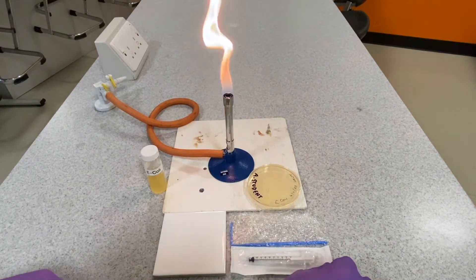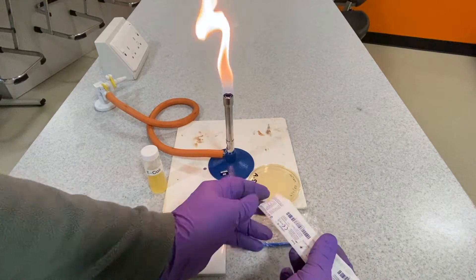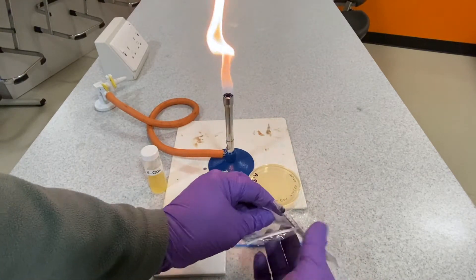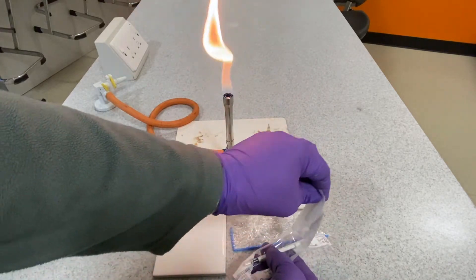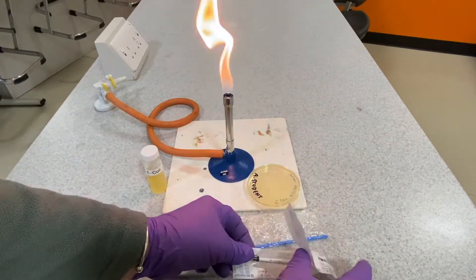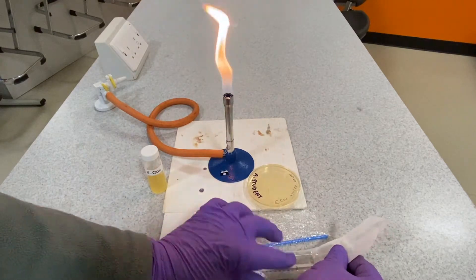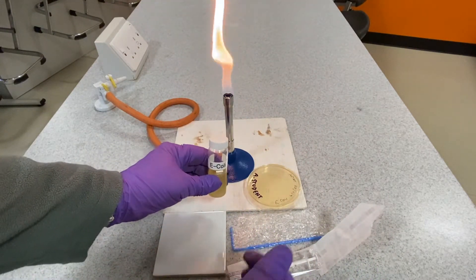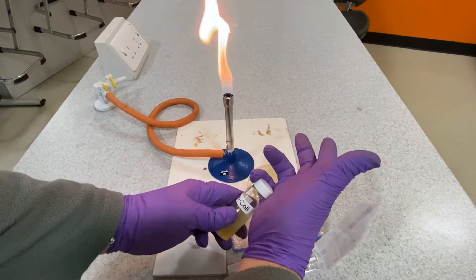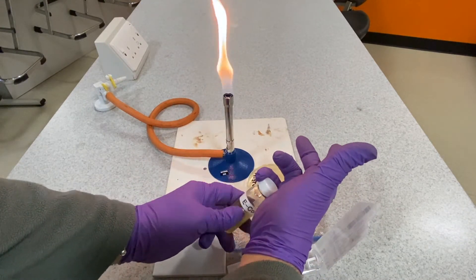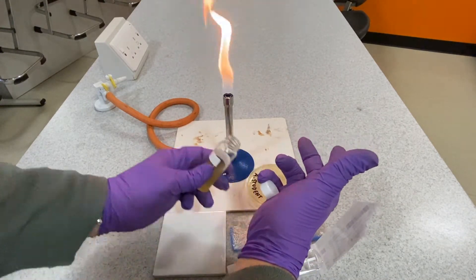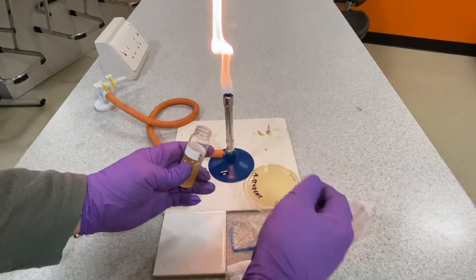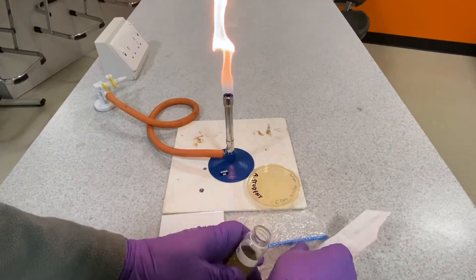Making a lawn plate. Using the 1ml syringe, open the packet and leave the syringe within the plastic wrapper. Open the bacterial sample using the method with the little finger of the right hand retaining the lid. Flame the neck of the bottle.